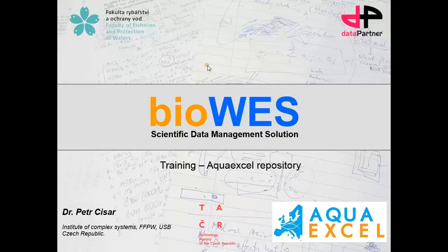The main idea of the training course is that the people who are involved in the Aquaexcel project or in one of the transnational projects can use the system to describe experiments or data processing, store the data on the Aquaexcel server, and use all the features of the system to support the experimental work.